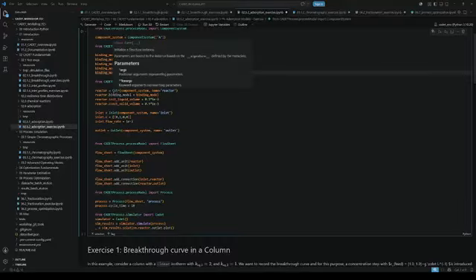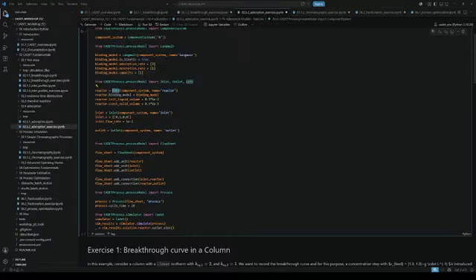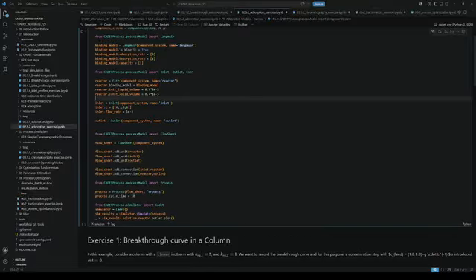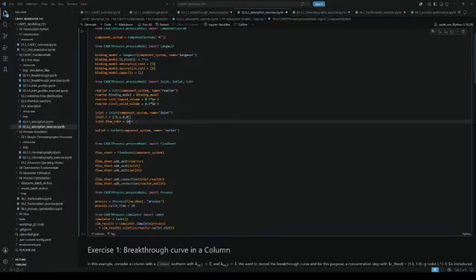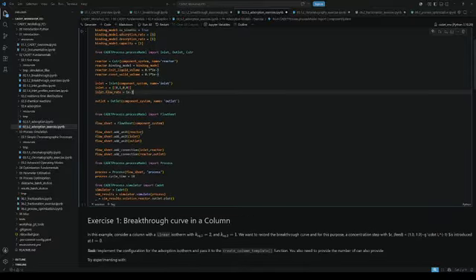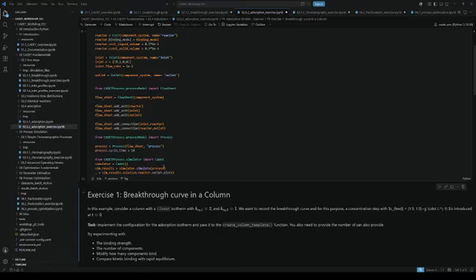Then we have to again look at some unit operations. Now we don't have a column here, but a CSTR, so a continuously stirred tank reactor. And for this, we have to define a volume of the liquid and a volume of the solid, right? So this is liquid phase, stationary phase. You can see it's around 50-50 between both. And then we again define an inlet, and this inlet component system has a concentration of 0 for our component A, and we have a flow rate of 1 times 10 to the power of minus 3. So this is again cubic meters per second. We have an outlet defined. We have to connect all systems again, and then we simulate this.